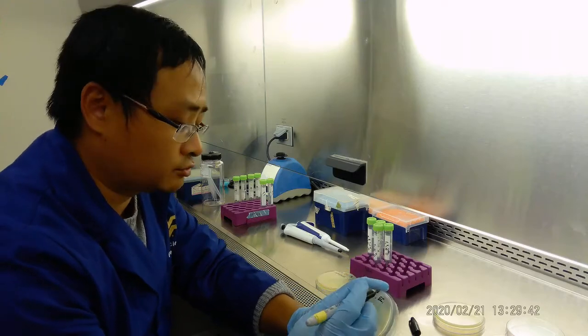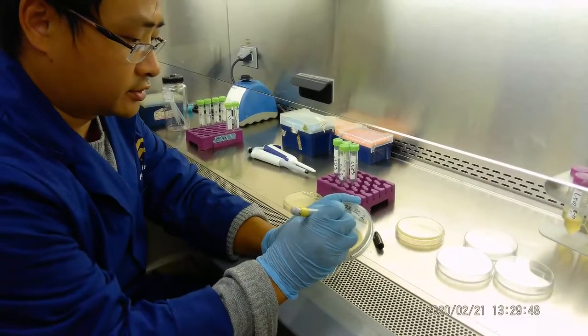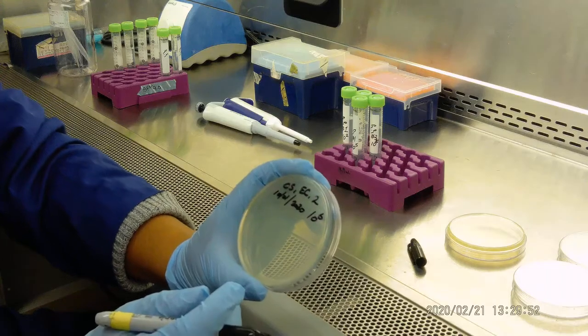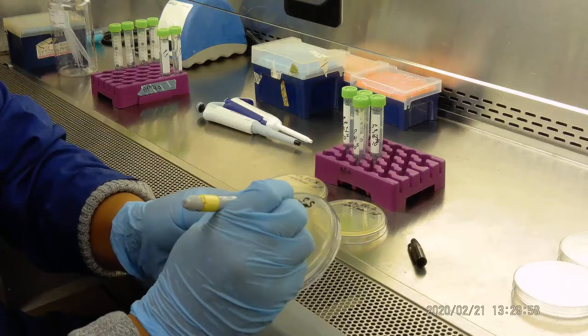Let's continue. We just interrupted. So for the second one, you label the bacteria name and date, and we're also going to label 10 to the 6. This one we're going to label 10 to the 6. Okay. Now the next one we will do the same thing, so we can do this real quick.